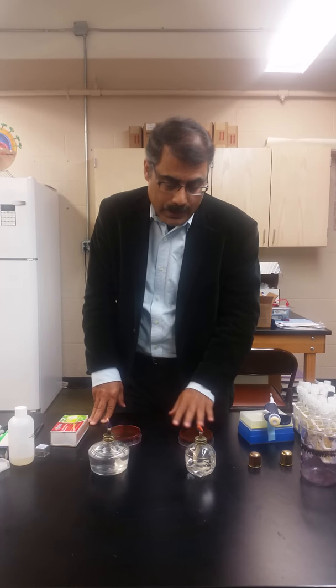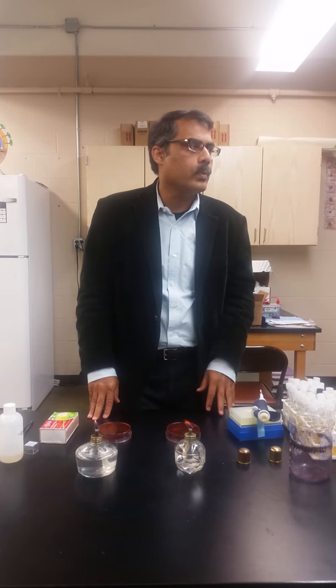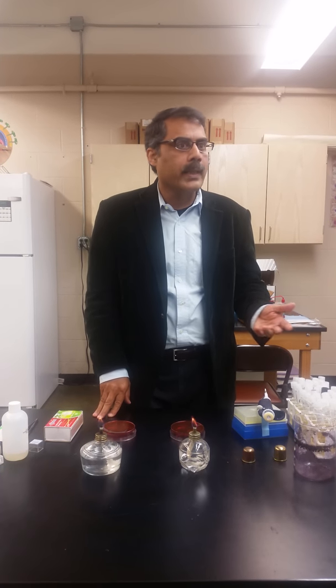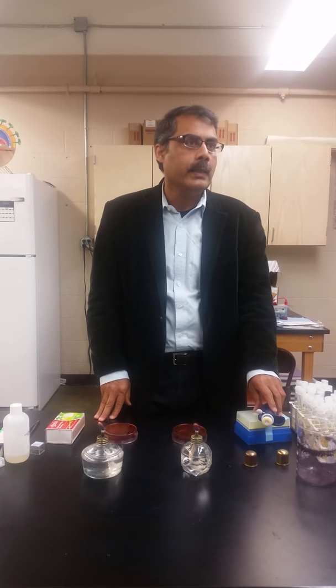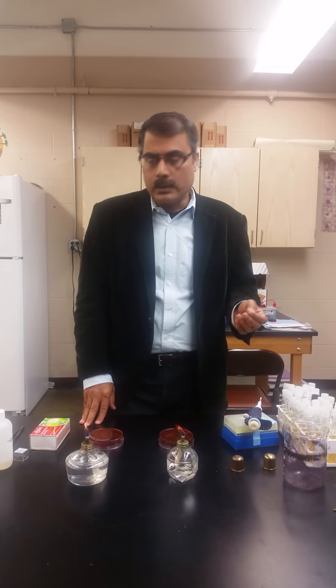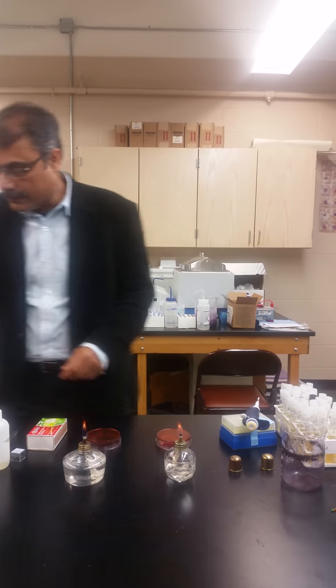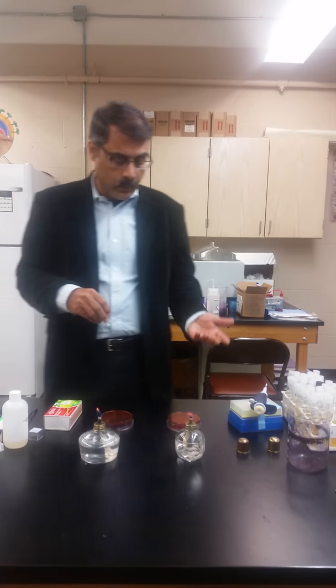But sometimes it will happen that there is an infection or a secondary infection which is not treatable by the ones that we normally use. So how do you actually screen for other antibiotics or other compounds? One of the ways to do it is basically take a culture before.